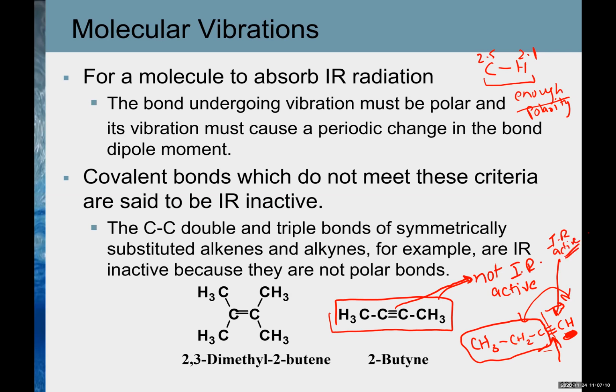So we can generalize that for a bond to be IR active, it must be polar, first of all.